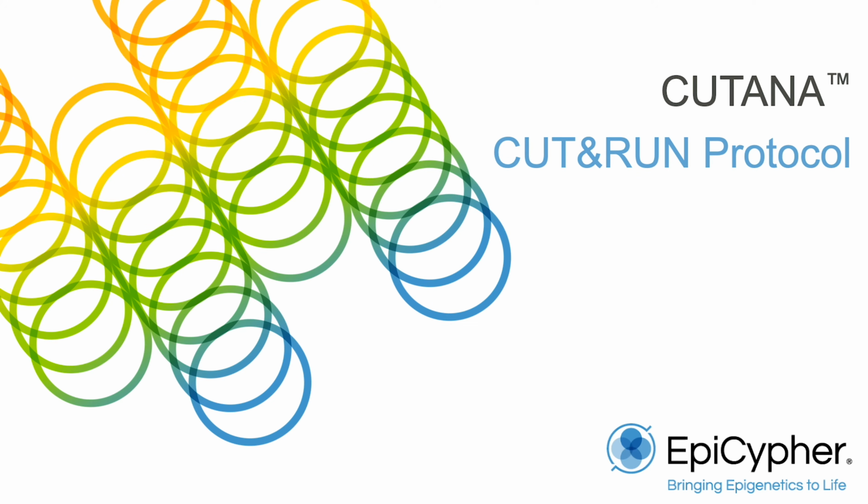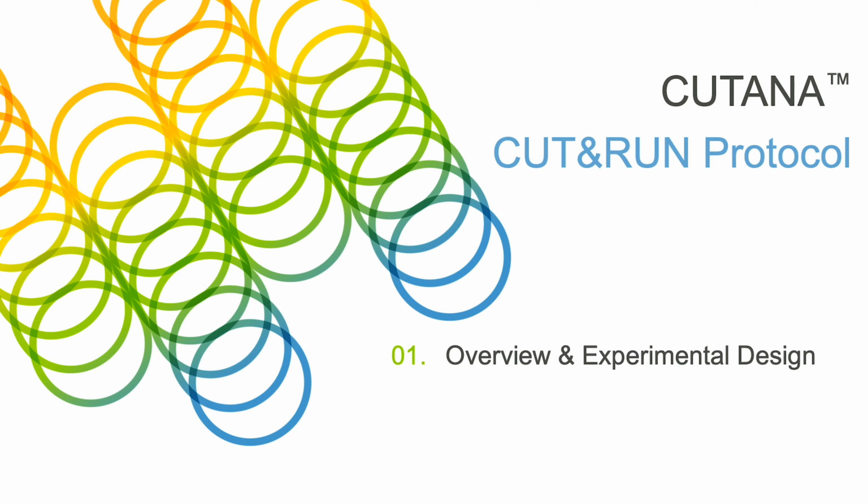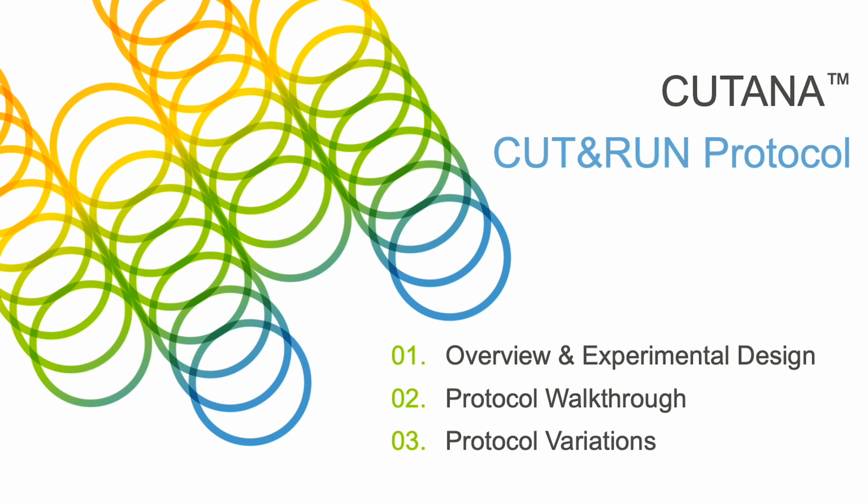This video will be broken up into 4 sections. First, I will give a brief overview of how cut-and-run works and review important considerations for experimental design and sample preparation. Then I will give a walkthrough of the protocol. Next, I will go over protocol variations and wrap up with a few frequently asked questions.